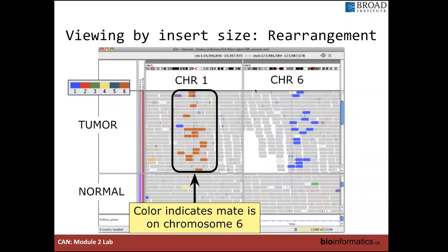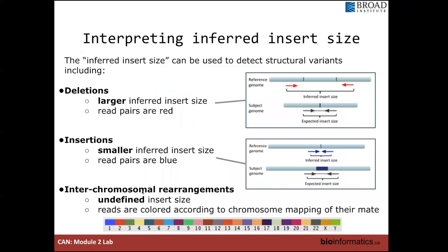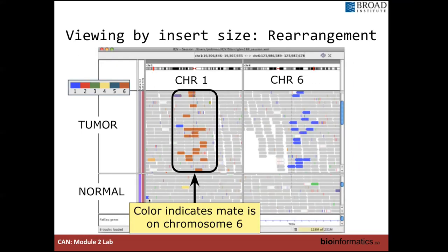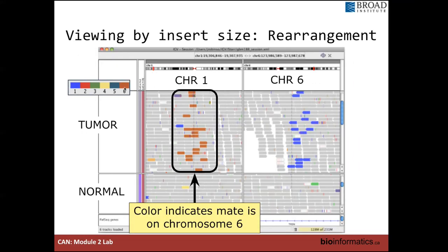We're actually looking at two different regions at the same time with IGV in a split screen, and we're looking at two different samples. So this is a tumor sample up top, a normal sample underneath. In chromosome one, some of the reads in the tumor are colored orange. And if I go back a step, if reads are mapped on different chromosomes from their mates, that's an undefined insert size, you can't quantify that difference because they're on different chromosomes. So this undefined insert size legend here will tell you which chromosome its mate is mapped to. So orange here means chromosome six. And sure enough, if we look at chromosome six and see the reads that correspond to these reads here, these ones are also colored blue indicating that their mates are mapped to chromosome one.